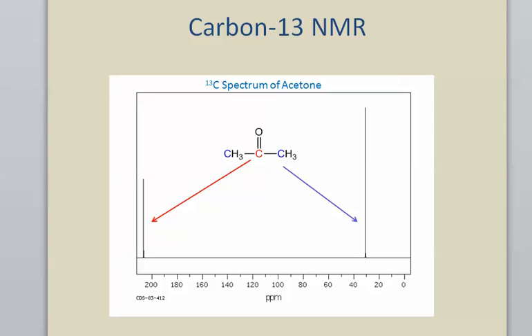Carbon-13 does couple to hydrogen, but it creates such complicated splittings that it's hard to interpret the spectrum. And so as you see in this example for acetone, with carbon-13 spectra, all you see is thin spikes. We get nothing but singlets because these are said to be decoupled. The spectra are run under conditions to suppress the coupling so that the spectra are simpler to interpret.